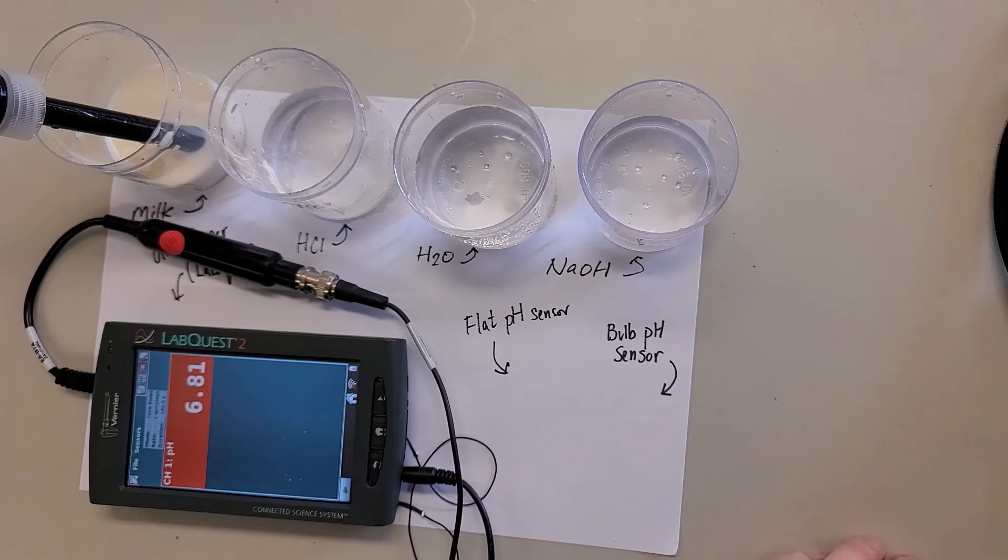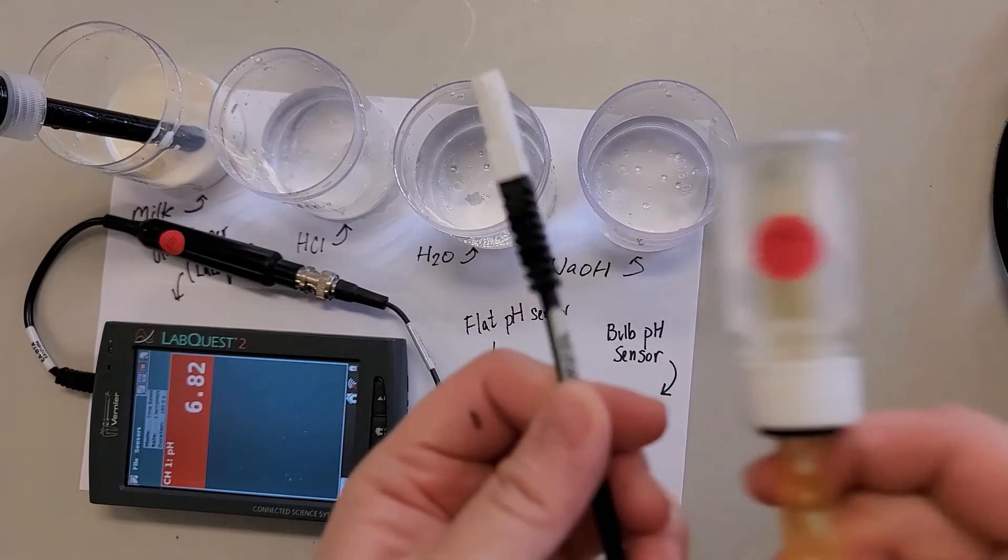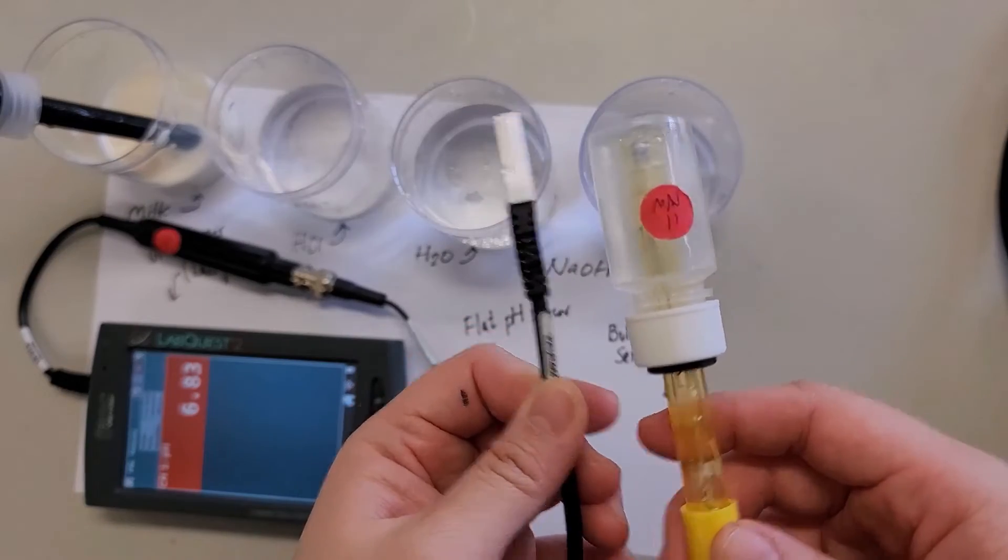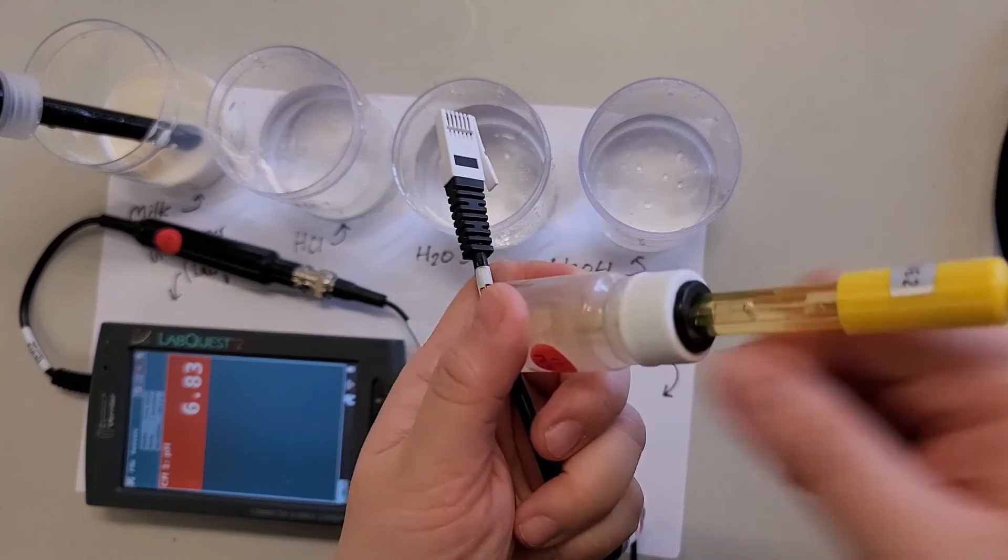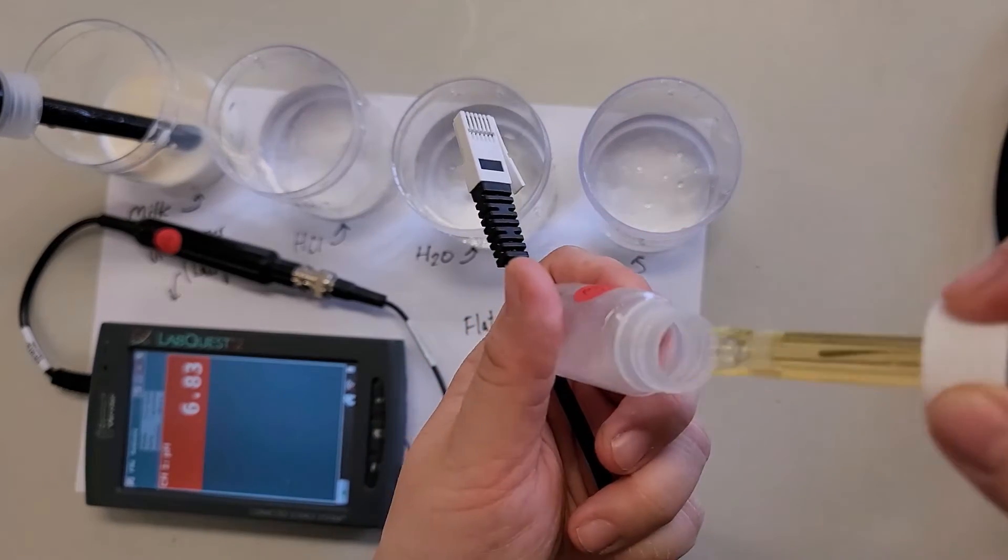Moving on is the bulb pH sensor. This one is the bulb pH sensor. When you take it out, just be careful. Screw it. Don't just plug it out. Just screw it and then take it out.